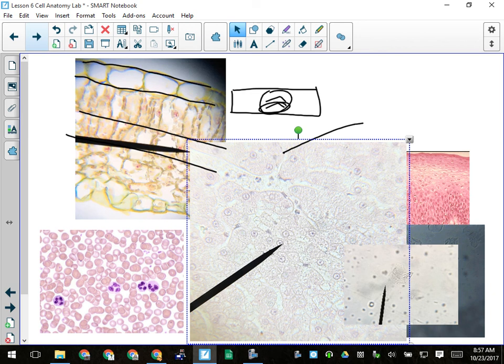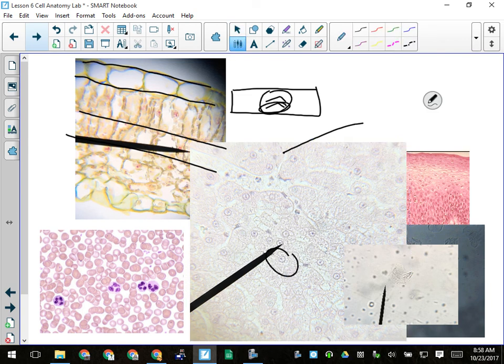And be able to see on this nucleus right here, see how it kind of has a beard? You've got to use your reasoning and imagination a little bit. You really have to look hard to find those structures, if you can, but you probably won't be able to get them all off of one cell.